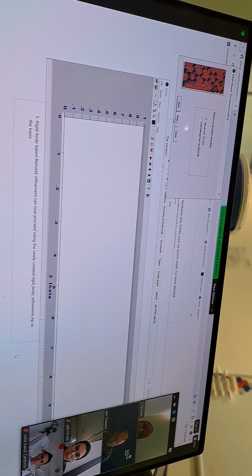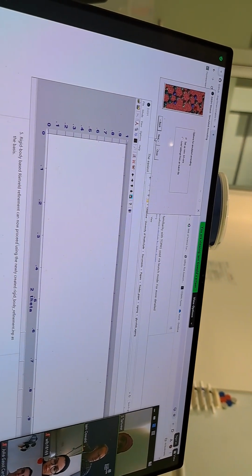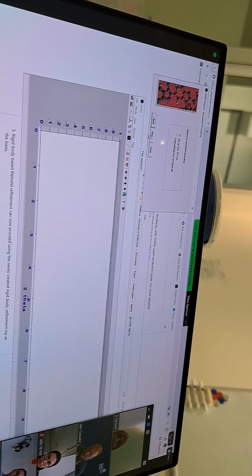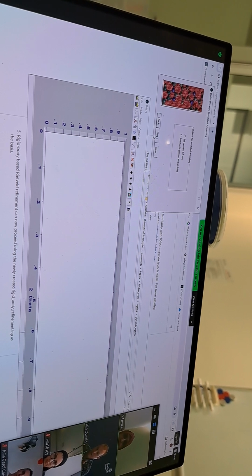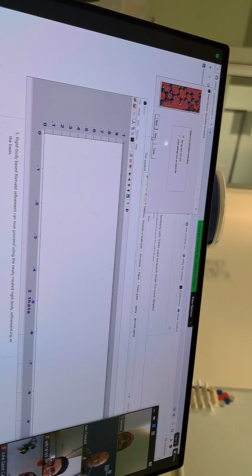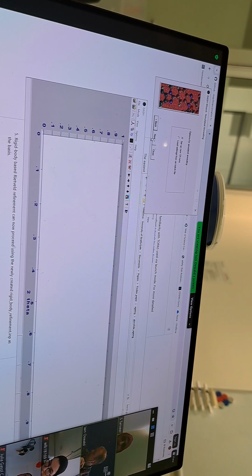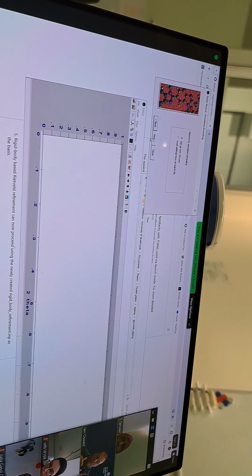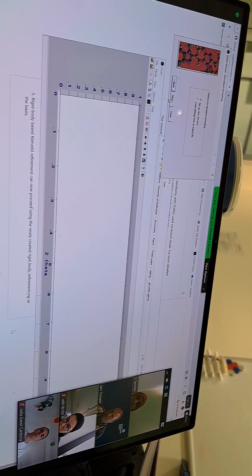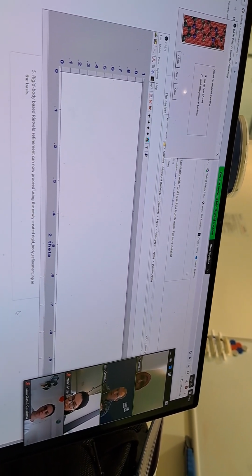Just as a reminder, we've got our CIF file, which is a coordinate-based system based on your unit cell axes, so fractional coordinates of a unit cell. Each coordinate is a fraction of the basis vector. Remember, your basis vectors are a, b, and c, your unit cell. They're called basis vectors because there's a direction and a magnitude associated with them. Each of our coordinates for our system is a fraction of a, a fraction of b, and a fraction of c.